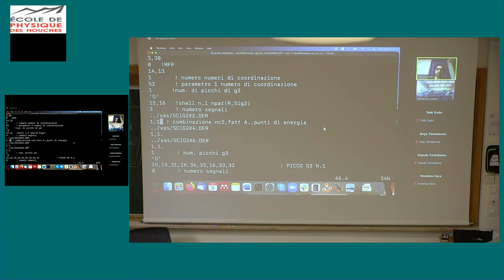And then here you can have a multiplication factor. So as I was saying before, if you want to use only 1 coordination number parameter, then, for example, in this case we have 4. If we have a signal which has a degeneracy of 8, we can just multiply by 2, or we can multiply by 0.5 to have a coordination number of 2, etc. Okay, but in this case we just leave 1.